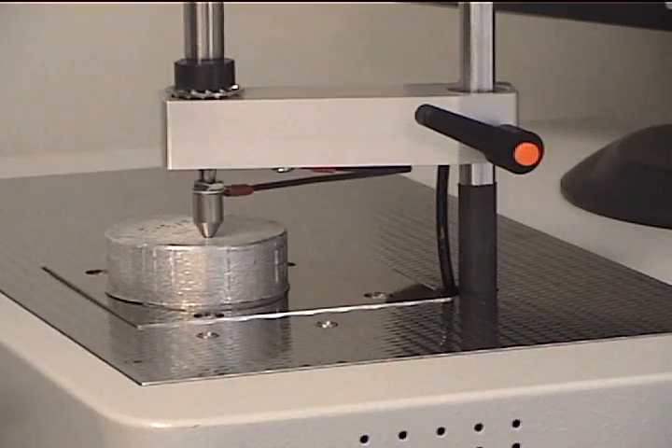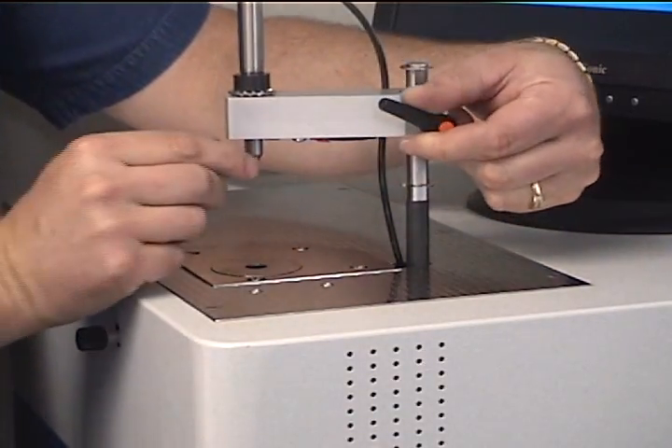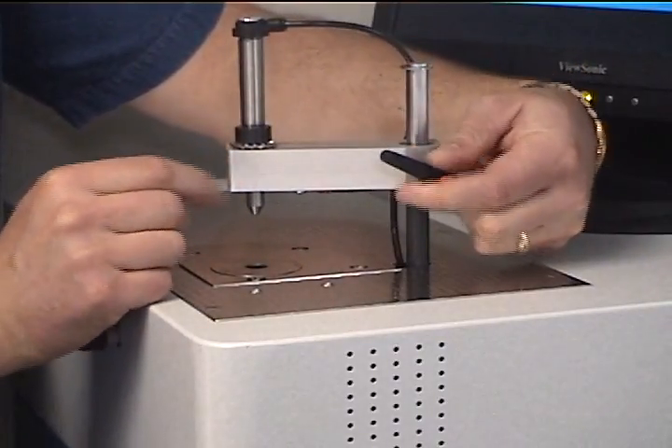Each time the start button is pressed, the sample clamp automatically locks the sample in place under pressure from the argon line. The clamp itself can be adjusted up or down depending on the height of the sample being analyzed.